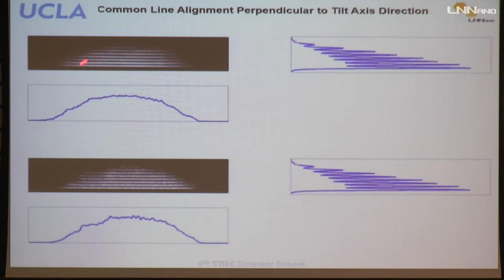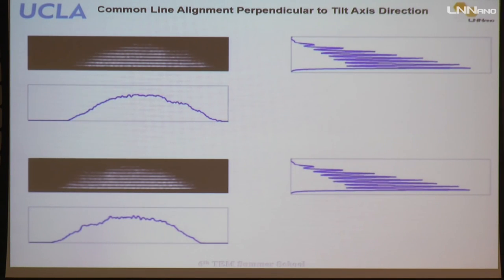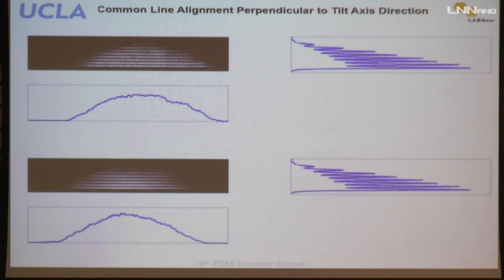So you can see, this is rotating like this. During the rotation, this object moves. So it's like this, rotating like this, with the rotation axis here. In this one, the rotation axis is in the center. So it's like this. Both of these cases are actually aligned, so you can reconstruct this object back.